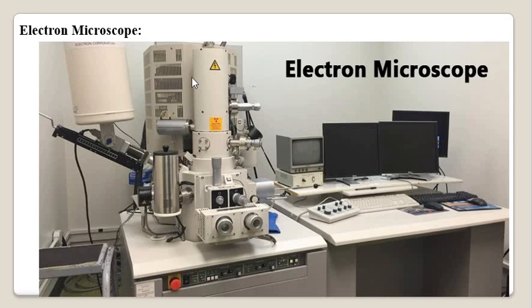So which are those short wavelength electrons? They're going to strike, because the electrons have the property to radiate in all possible directions, so they strike in all directions. So this metal shield is there, which is going to protect the operator, a person who is going to operate this microscope, from the harmful X-rays, right? Then electromagnetic lenses or electromagnetic coils are there, right?